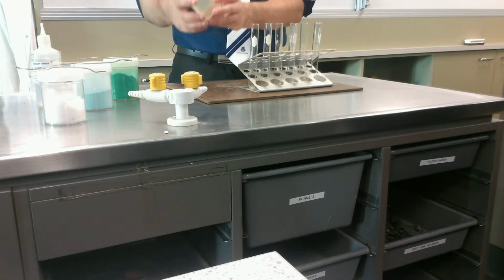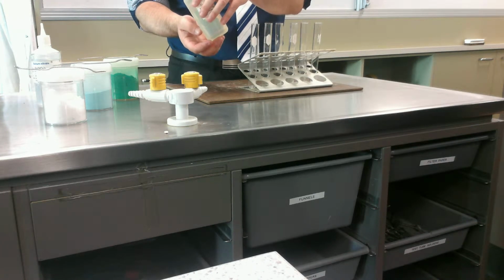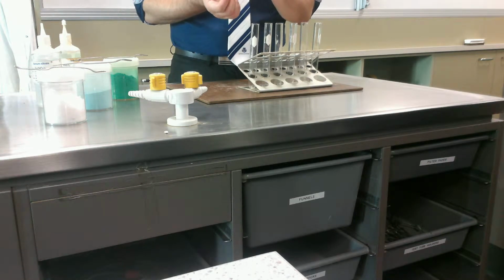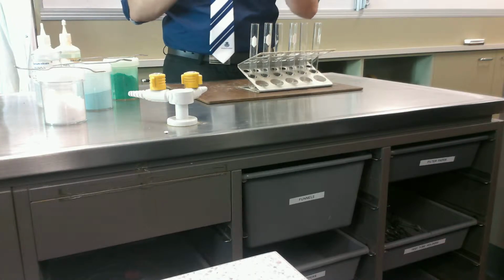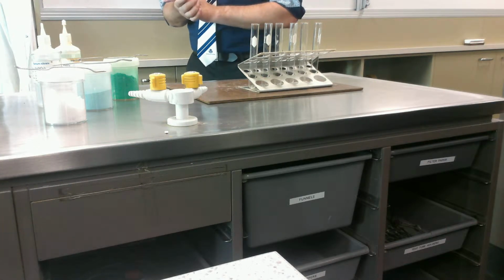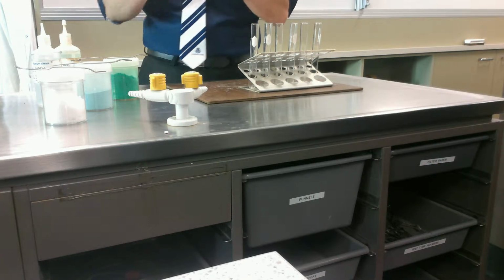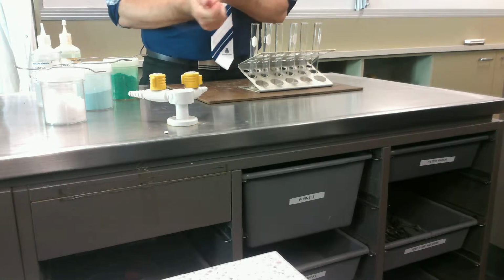And what a solution looks like, it's see-through because it's got no bits of solid floating in it anymore. The solid's actually broken up and has water particles in between them. I'll draw that up on the whiteboard later for you guys, so when I photograph the whiteboard you'll have a picture of that, okay? As well as those keywords that we're going to go through. What I'm going to show you quickly today is the difference between a solution and a suspension. And then I'm going to quickly show you what a precipitation reaction is.